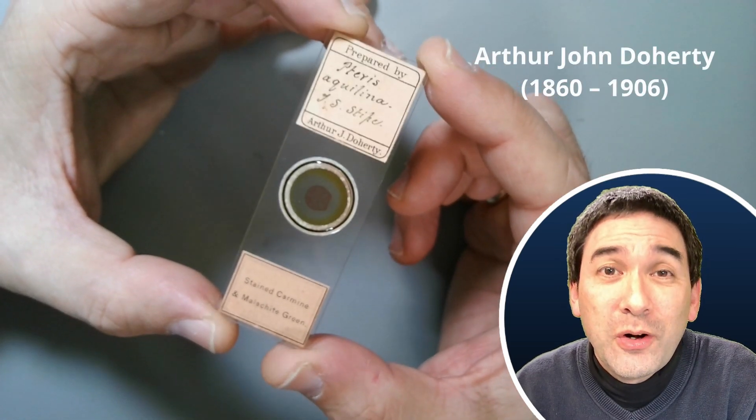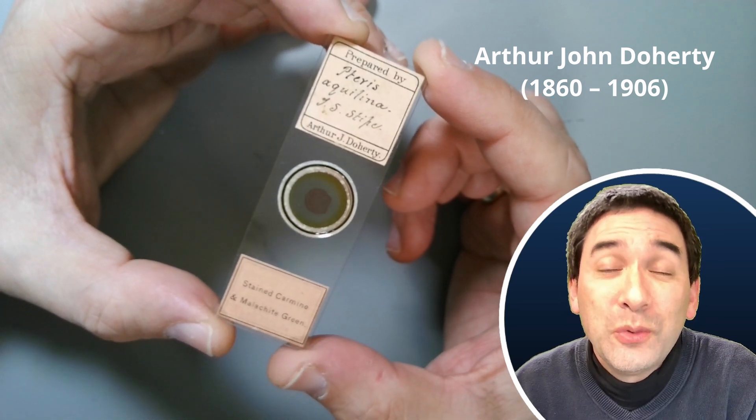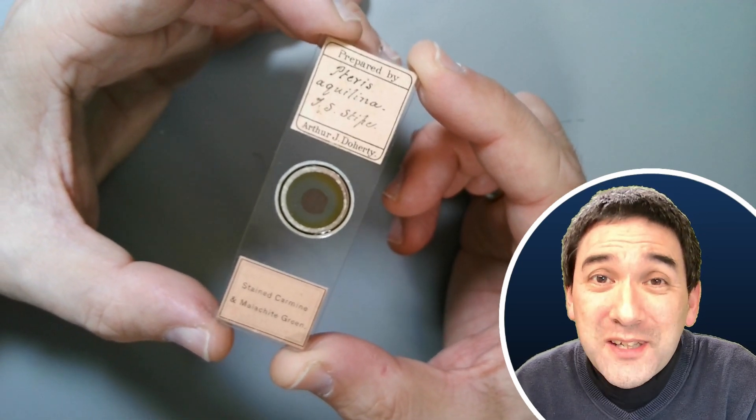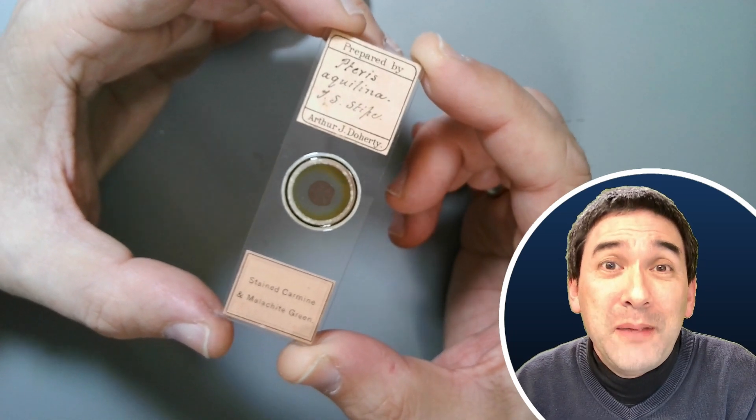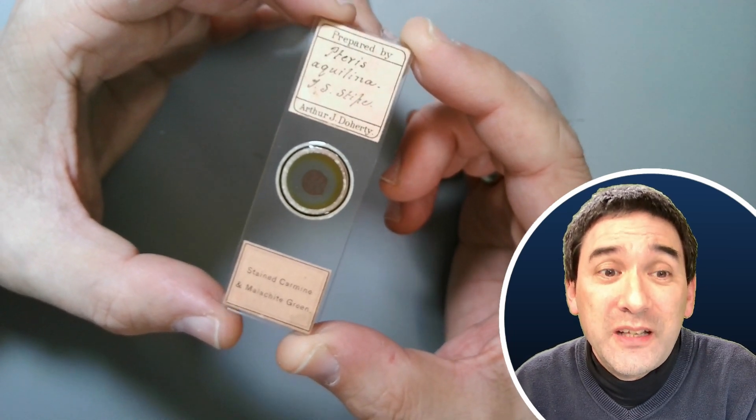The slide maker Arthur J. Doherty, he passed away in 1906. He did not get very old. He was only 46 years old, but he made quite a few slides which are still available today.